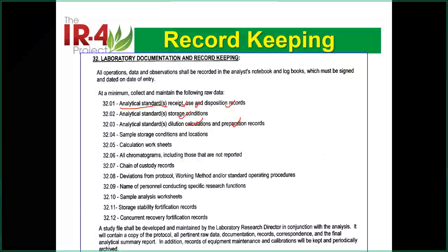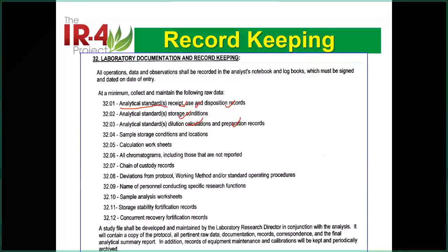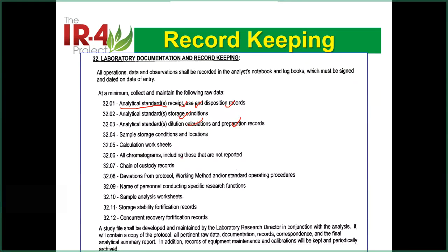So even if you take 0.01 gram, you need to have a record, and why you did that. Okay, I do the calibration, I do the spike, because you have to have 2 lines to do the work. And when you dispose of that, because after like 5 years, it's all expired, you don't keep them. In my lab, we keep the standards permanently. We just keep them there. Even though it's expired, we put it on the side. So you need to have a record that you did that, or you put it somewhere.